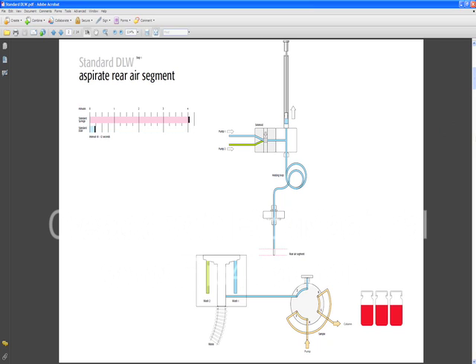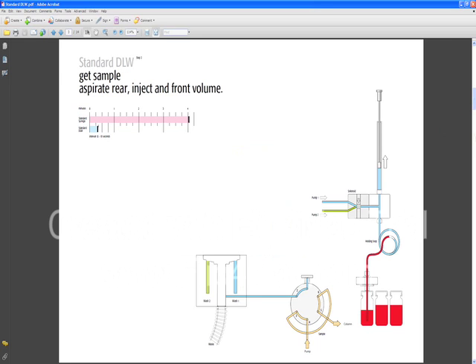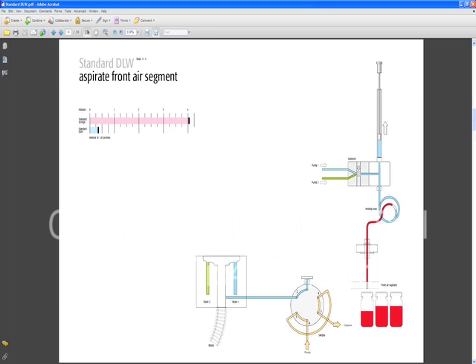First step, syringe goes up, pulls an air gap. Second step, we go into the sample vial and pick up the appropriate amount or the programmed amount of sample. As you can see, the sample is totally buffered by the air gap and by solvent number one from the syringe. As we come out of the sample container, we pull a second air gap.